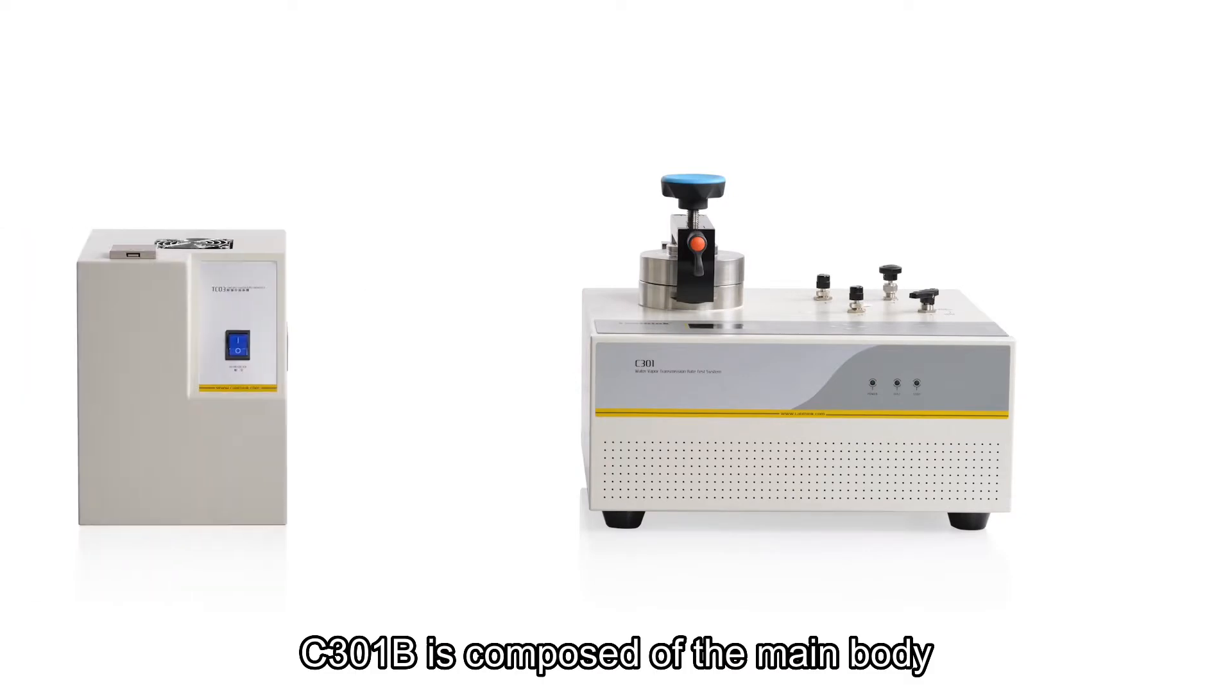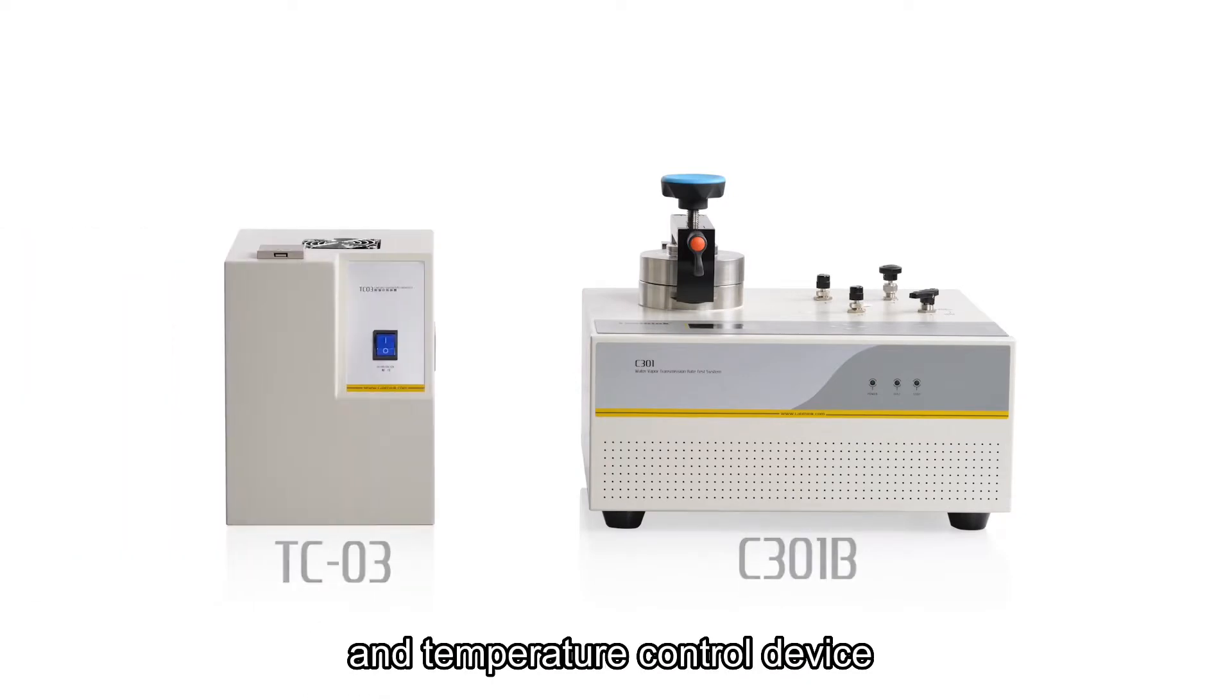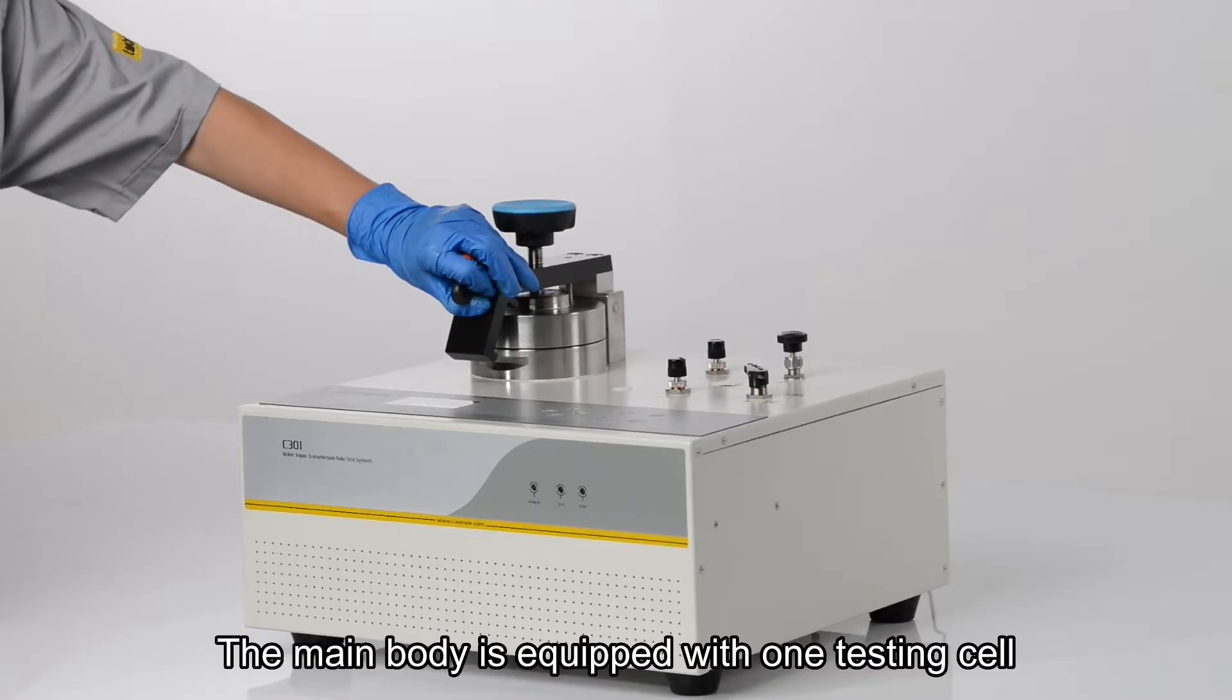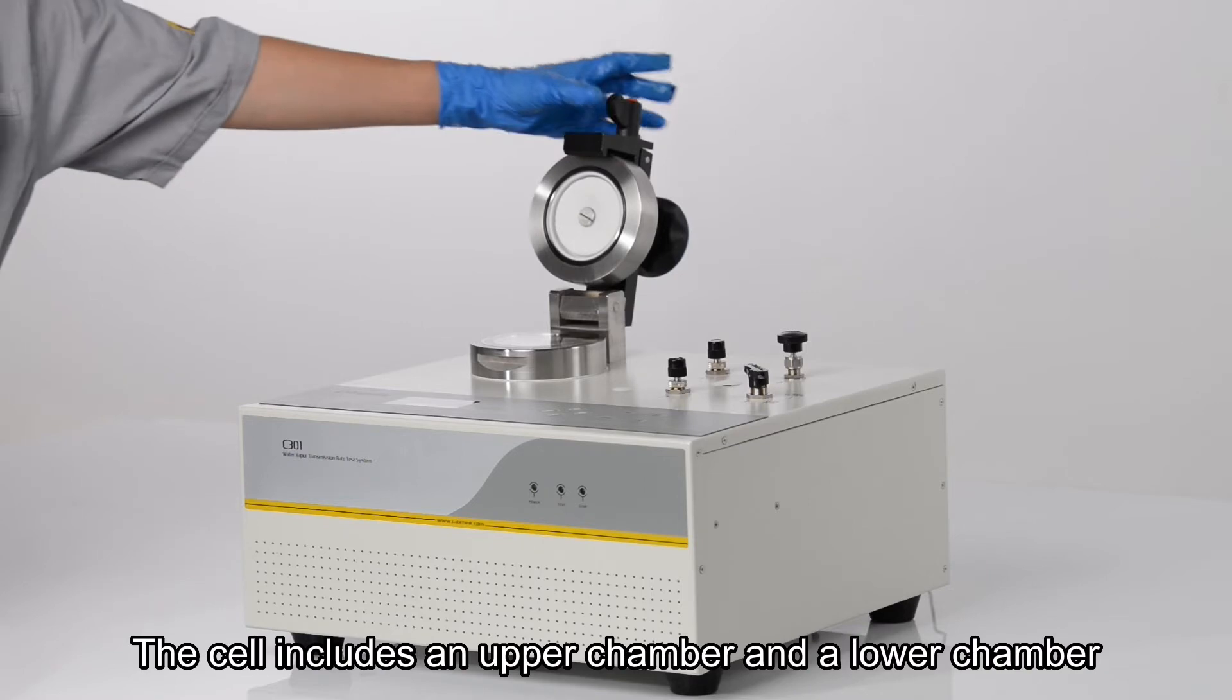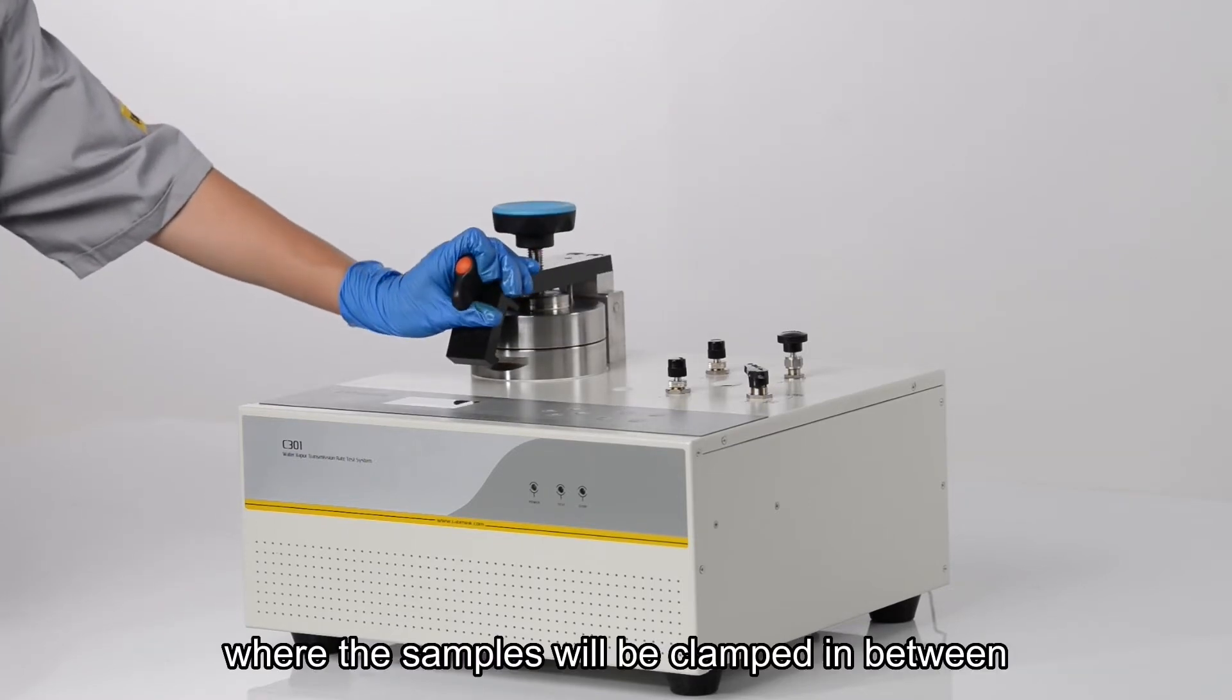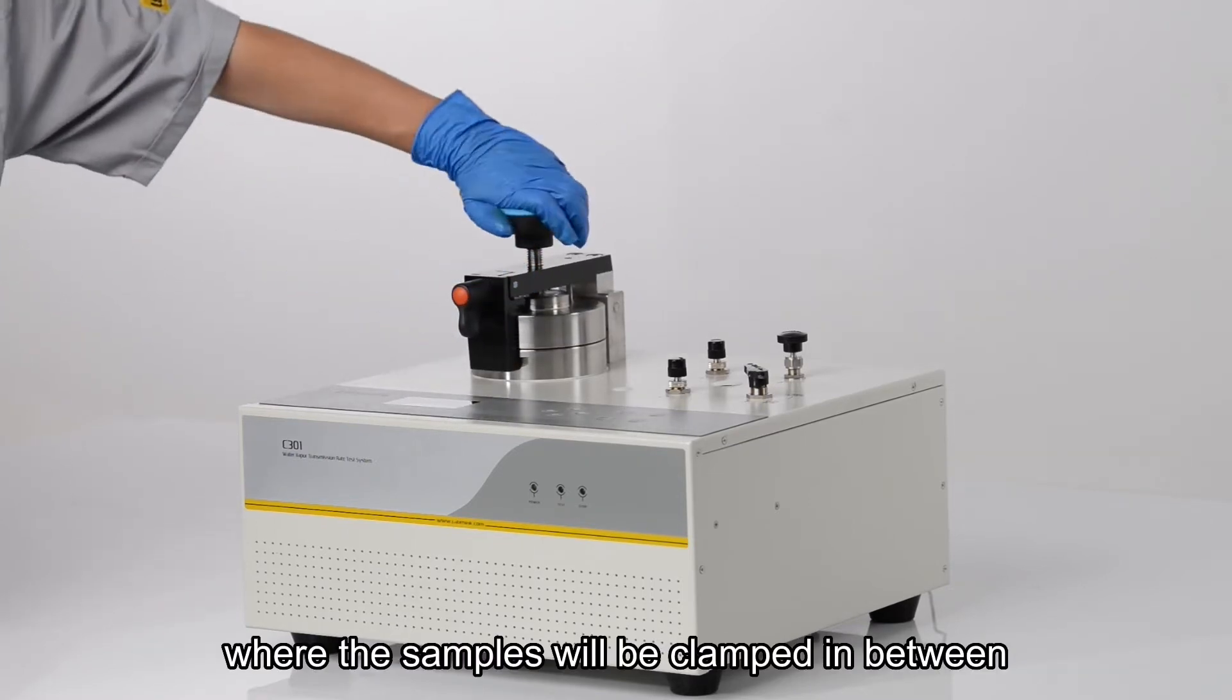C301B is composed of the main body and temperature control device. The main body is equipped with one testing cell. The cell includes an upper chamber and a lower chamber, where the samples will be clamped in between during testing.